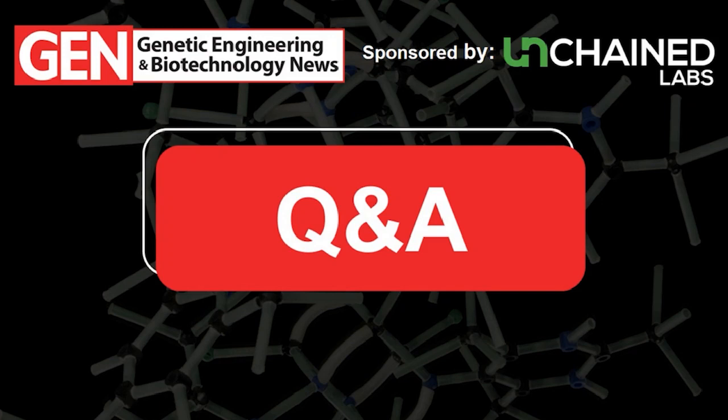All right, thanks for that. Kevin, another question for you. Audience member would like to know, does the system have 21 CFR Part 11 software?